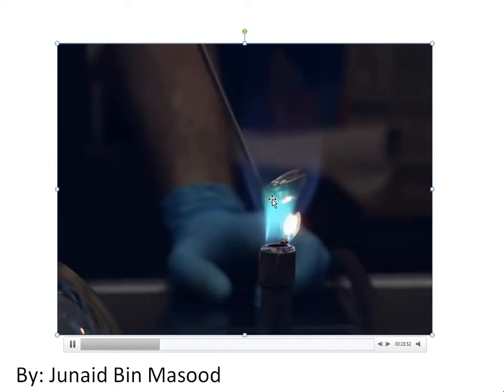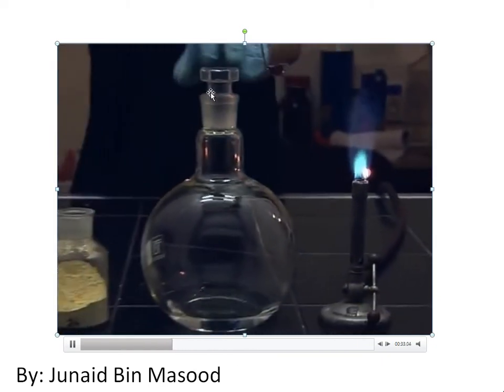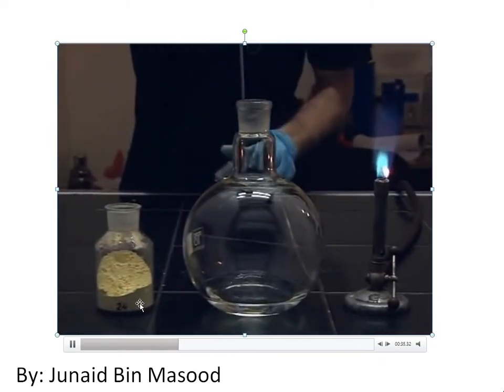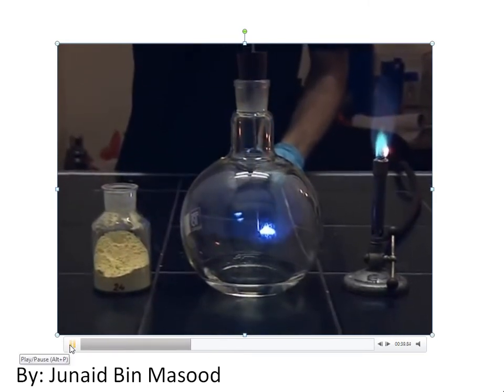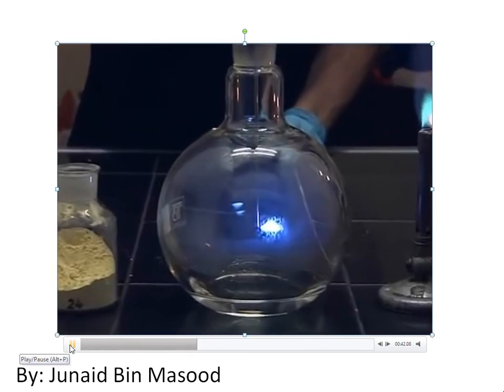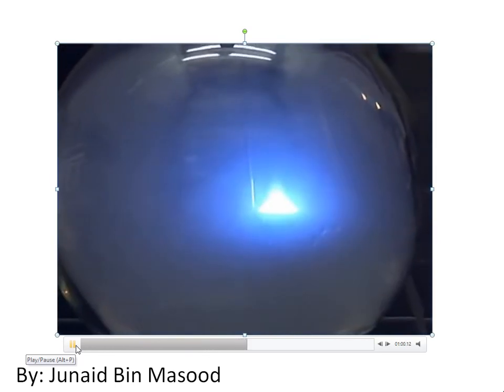Sulfur doesn't burn in the absence of oxygen. So we heated sulfur. Now after heating we are going to open this and place the sulfur in. So see, it's a blue flame, beautiful blue flame. The same picture, figure 8.14 on page 166 of your book, is shown. So this is the reaction of sulfur with oxygen, and it forms sulfur dioxide. Di means 2, so it is SO2. This is sulfur dioxide, blue flame, okay?